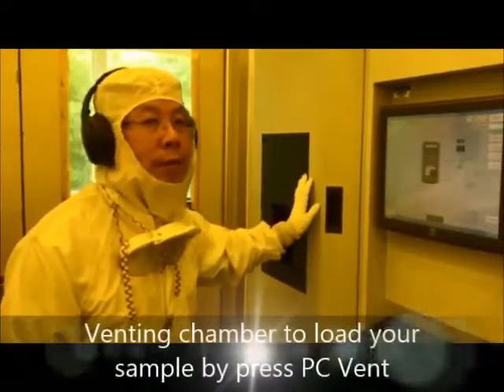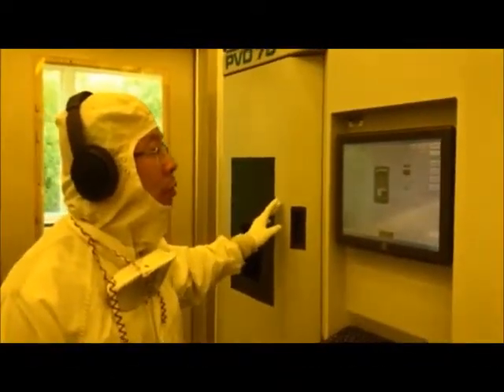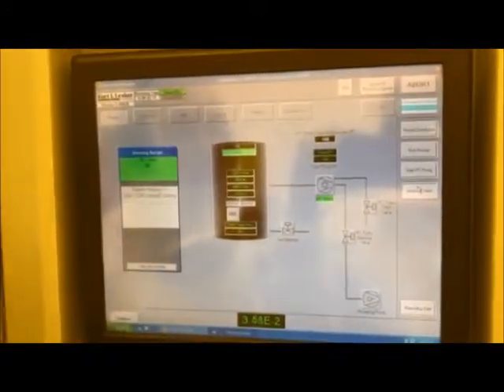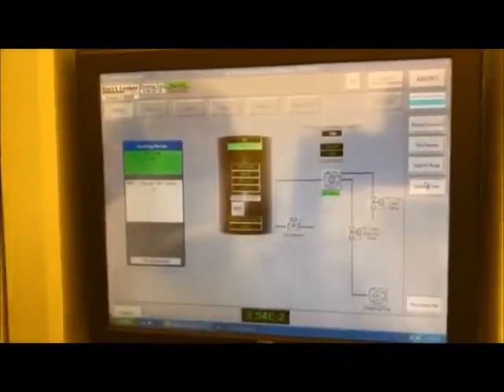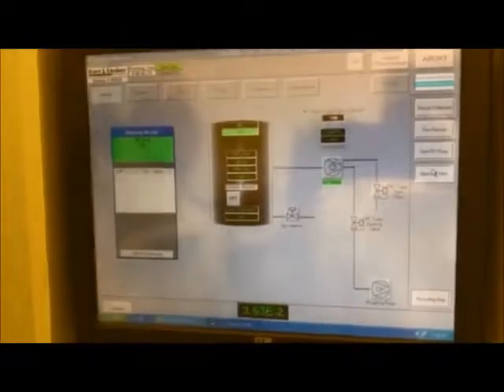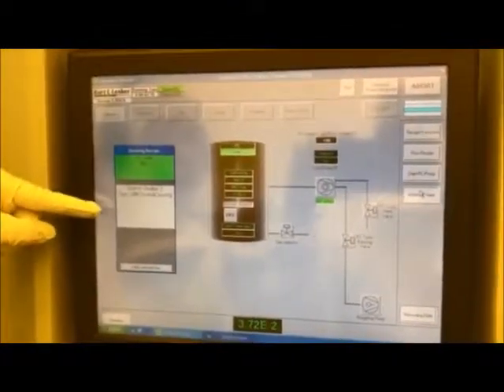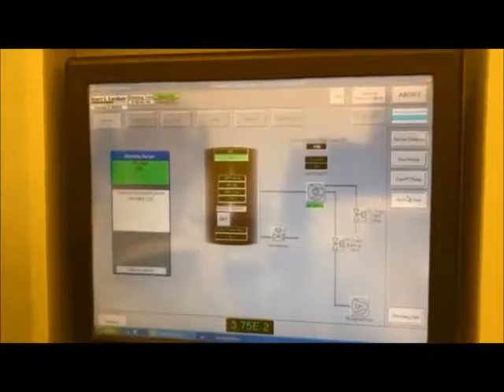About to load the sample to the Lesker chamber. To load the sample, we have to vent the chamber. To vent the chamber, all you need to do is press Start PC vent, and the whole process will be automatic. It will ramp down the turbo and then inject the gas to vent the chamber. Normally it will take about 15 minutes for the turbo to ramp from 100% to 0%. Basically, the turbo totally stops. Once it's finished, it goes through all the steps in the PC1. Once it's finished, you will see PC1 complete. And then when you see complete, you can open the chamber.